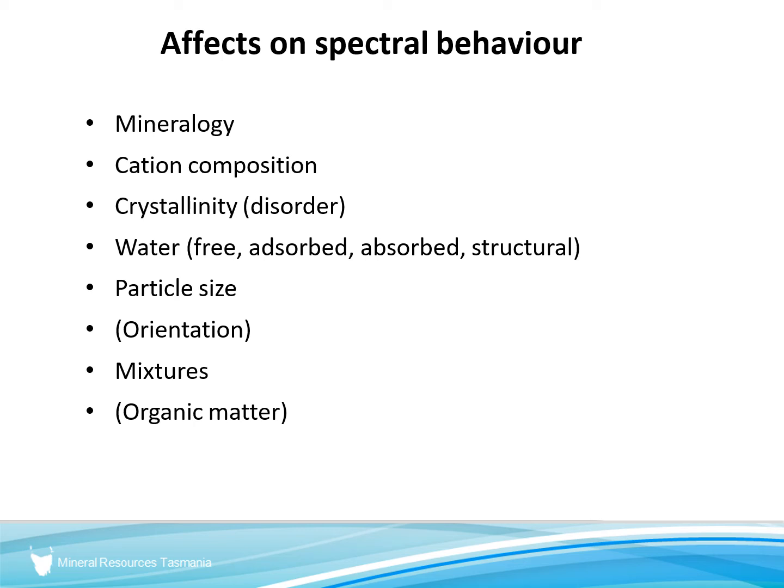Right, welcome back everyone. So what I intend to do is show a whole lot of examples of how HyLogger is used, most of them to do with alteration geology, some not. And I'm going to do it by looking at what the effects are on spectral behaviour. So it's taken from a slightly more technical point of view. But as we go through this, we'll touch on all sorts of things, alteration. Okay, on with part two.